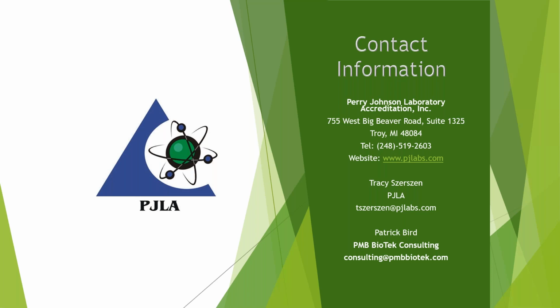I think that's the most accurate way right now to run molecular methods until we have refined the techniques a little bit more closely. The diversity of organisms when we're talking about total aerobic count, total yeast and mold count, even total coliform to an extent, is pretty extensive. And so for a method to be as accurate as it needs to be for those action limits, having more of a threshold detection is my recommendation.